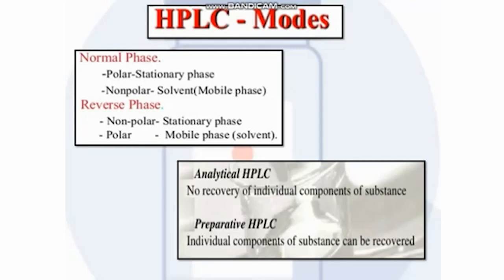But by using preparative HPLC, each component or each molecule of a mixture can be analyzed and recovered. So this is the classification of HPLC based on phase and similarly based on operation.